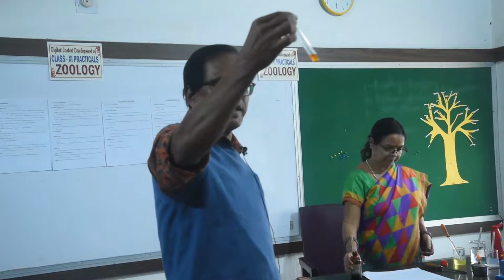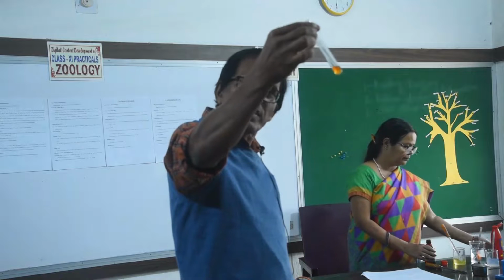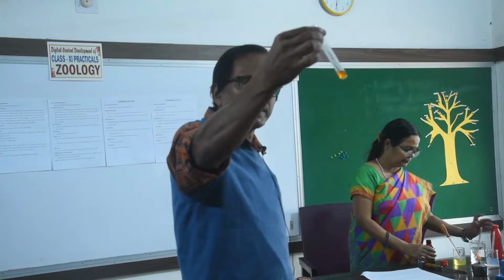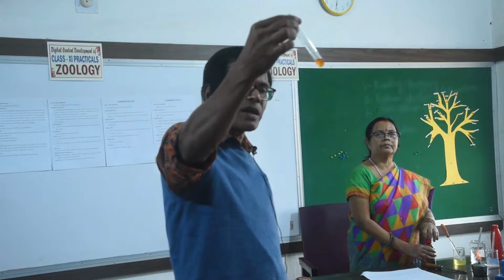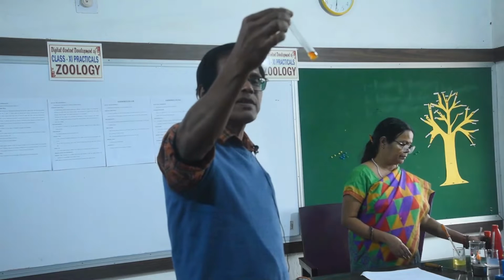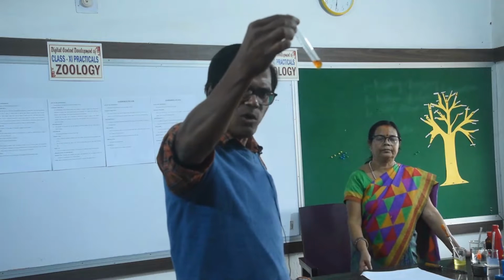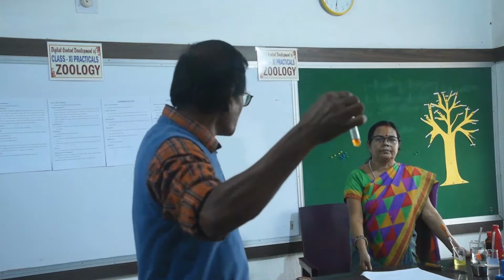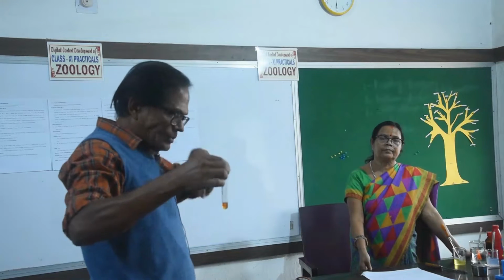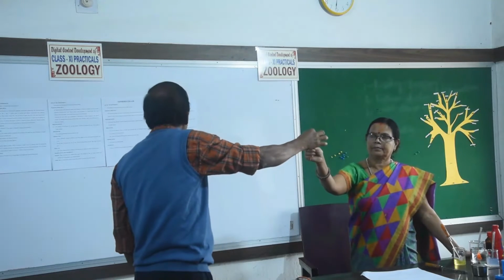This is the color. Look at this. It sometimes becomes a more intense red color. If a red color develops, then the test sample is confirmed to be a fatty acid or a fat or a lipid. We test for the lipid. So, the Sudan test for a lipid.